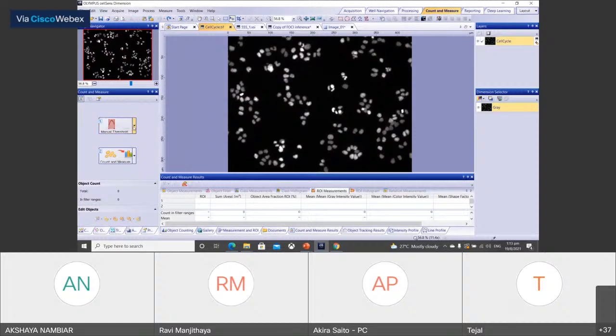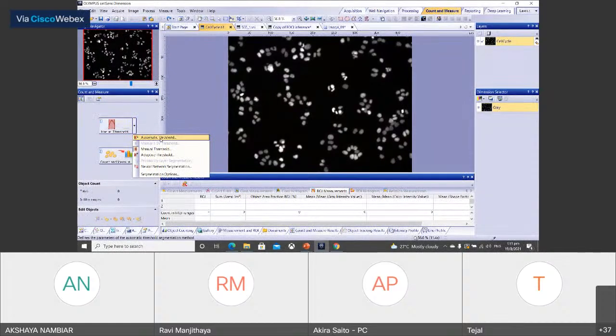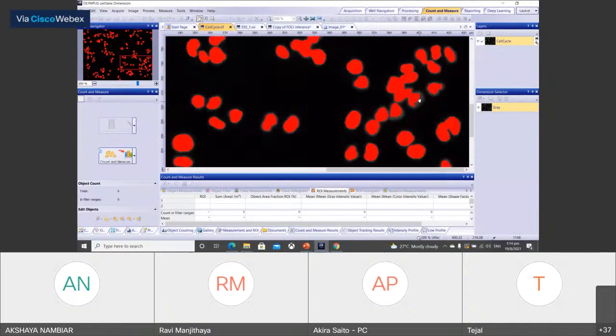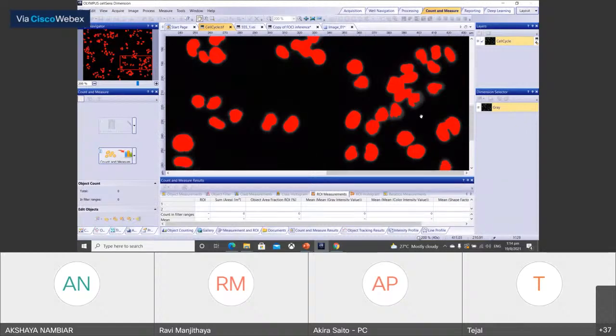Sometimes there is an automatic threshold in the software. Of course, you can use that kind of automatic detection, but sometimes it does not work as you expected. Like here, you can see that some of the areas that you would like to detect are not detected.